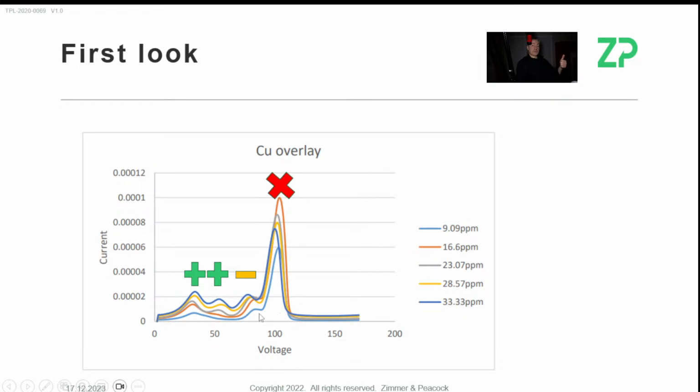It works well on the first event, works okay on the second event, starts to break down on the third event, and doesn't work on the fourth event, because you've basically depleted the copper in the first 2 peaks. So the relationship between copper concentration and copper peak has really broken down, because the simple model which says you plated it and then you oxidized it is not true here. You're actually oxidizing it first, second, third, and fourth.